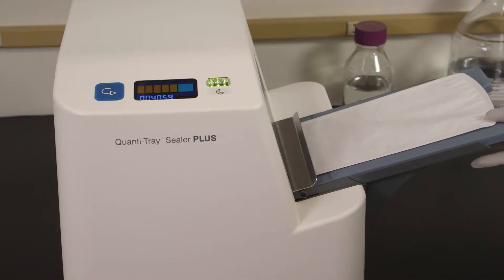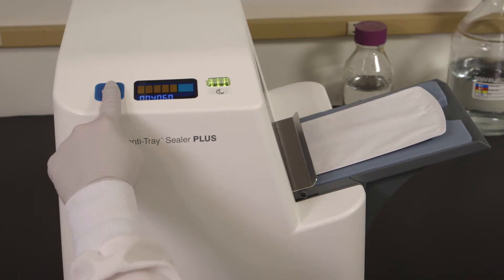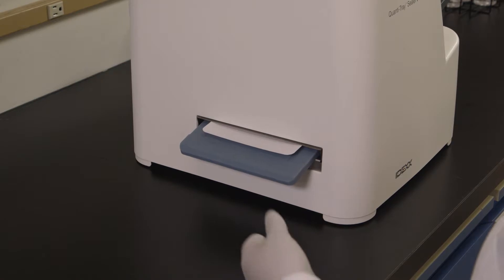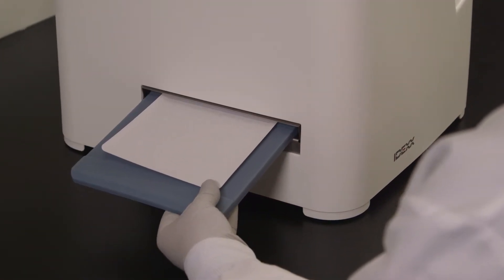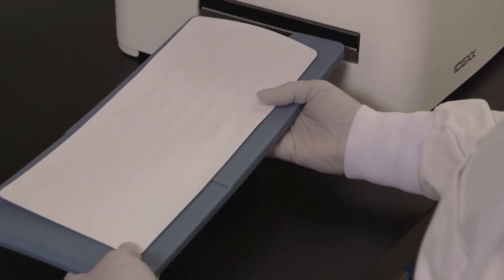If you need to reverse the motor, press and hold the reverse button. However, do not reverse the motor if the rubber insert is completely inside the sealer. The sealer distributes the sample mixture into the QuantiTray LEG-ALERT wells, seals the wells, and partially ejects the sealed tray. Remove the rubber insert and tray from the sealer.